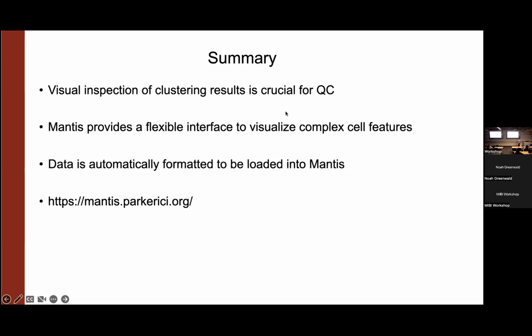I think to that point, Noah and I were actually talking about this yesterday. For most of our cohorts, we go back and manually inspect them, looking at your most recent one, it looks like probably 85 to 90 percent of the assignments look right. The important thing to remember is that the bar is not that you can look at your images in detail and not find one mistake.